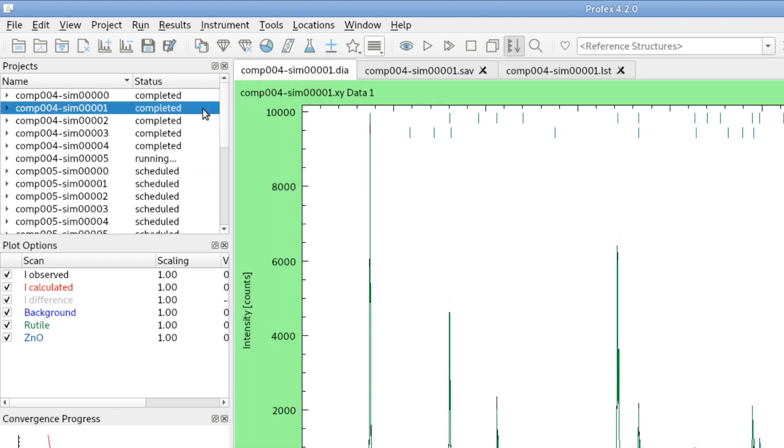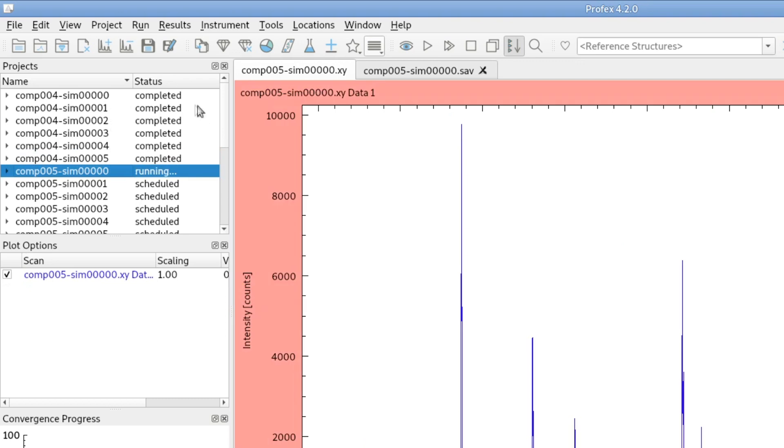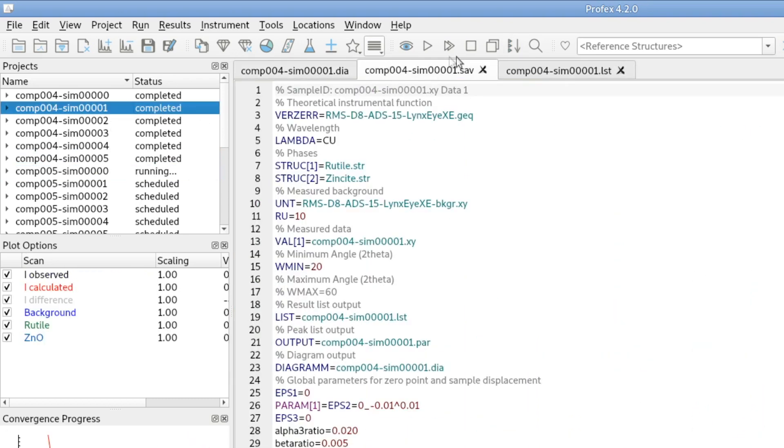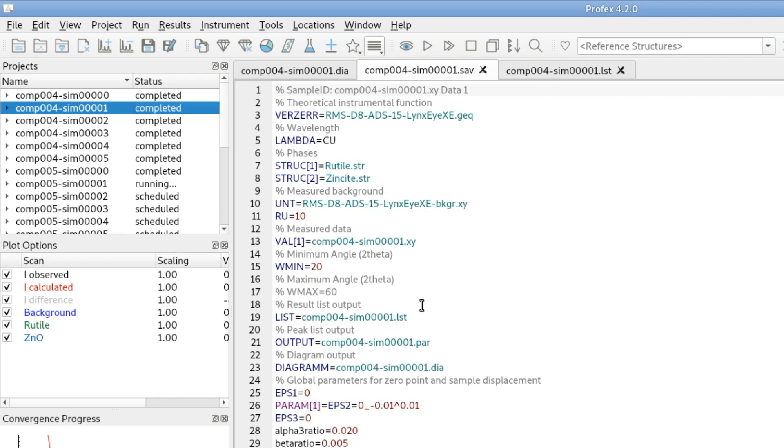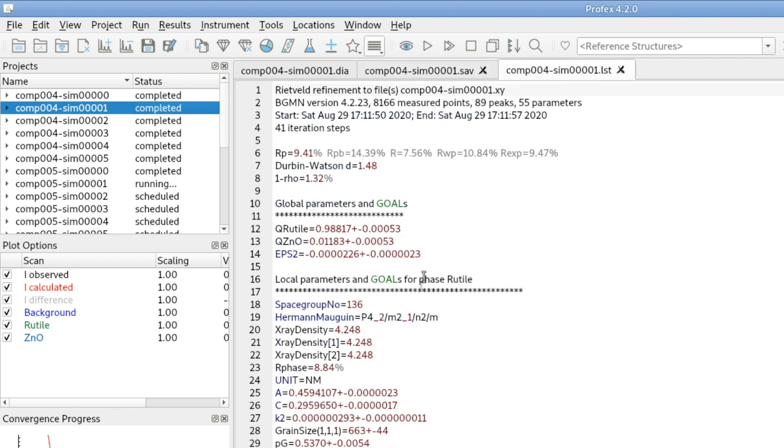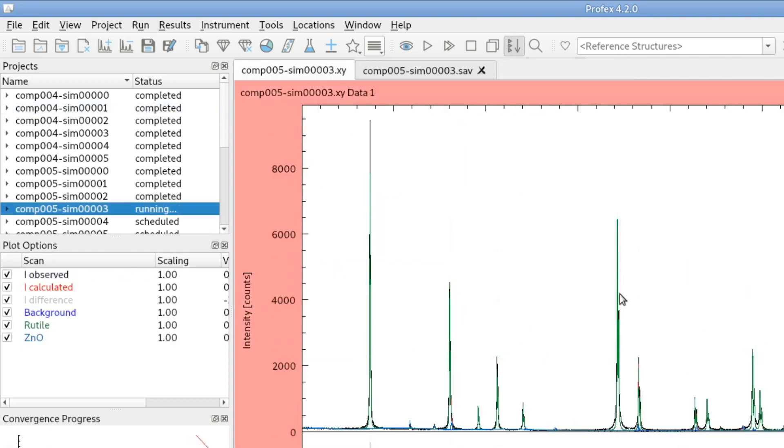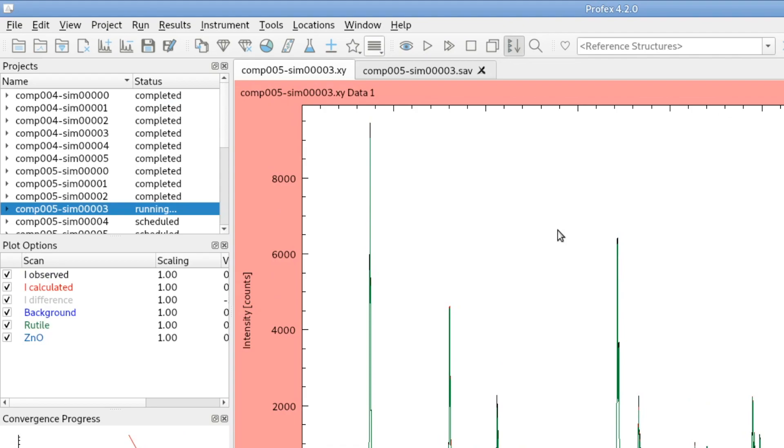If I go to one of the projects, this feature following the active refinement will be deactivated, because I don't want it to jump to the next refinement project while I am reading or editing this file. So while I'm reading something here, it will continue processing files, but it will not jump to the active one. And as soon as I click this button again, it will start following the active refinement.